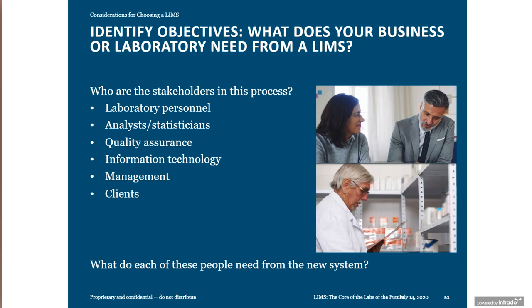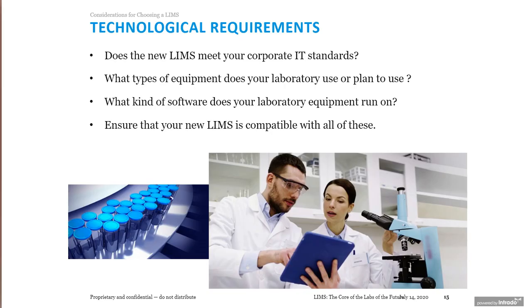And the ones who are going to give you that information are your stakeholders: your laboratory personnel, analyst, supervisor, manager, the director of the lab, the vice president, quality assurance, the team from product release and operations, even information technology, and your clients. The second thing, once you identify the needs, is you need to ensure that the solution meets those needs. And secondly, that the system is able to comply with your minimum corporate IT standards.